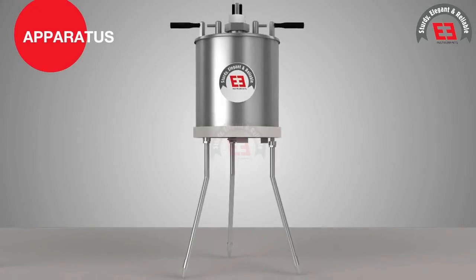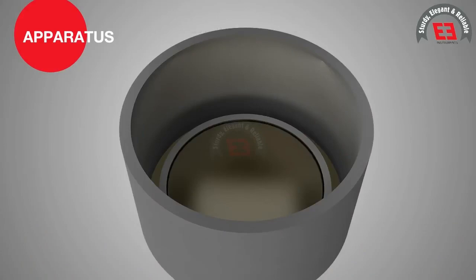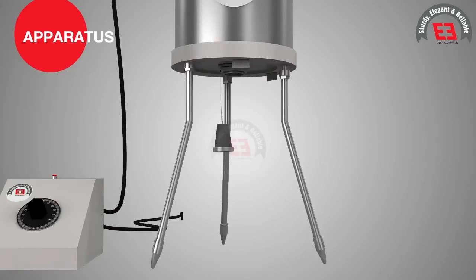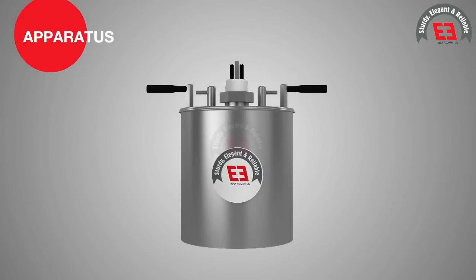Apparatus. Saybolt Furol Test Apparatus consists of an oil tube with overflow rim at the top. The oil tube is having an outlet orifice of 3.15 mm internal diameter and stopper cork at the bottom. The oil tube is fixed in a thermostatically controlled water bath with stirring device.